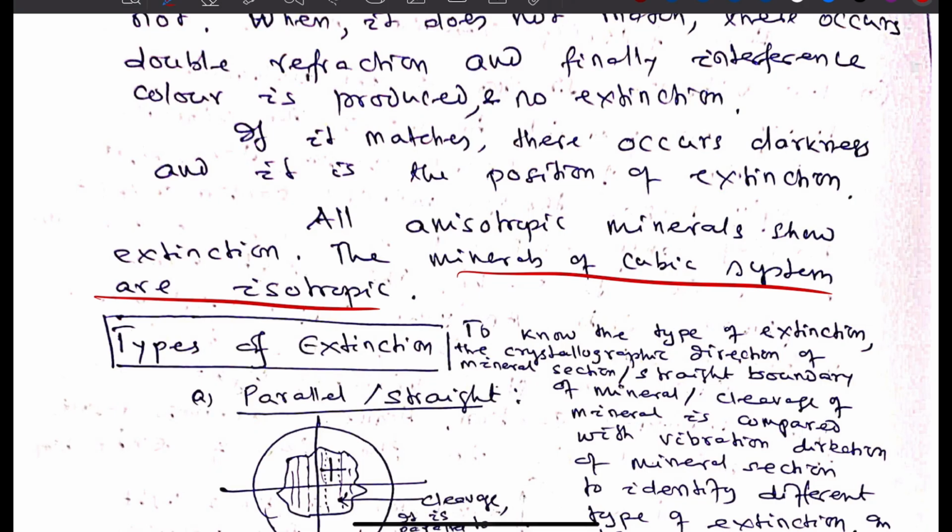If it is coming parallel to north-south of the microscope from the polarizer, it will simply pass through in that direction through the mineral section, and it will hit the analyzer perpendicularly, so it will not be allowed. Even if the stage is rotated, the same situation will prevail, and therefore the mineral section will show complete darkness, and it is a state of isotropism. So isotropism is seen by the minerals which crystallize in cubic systems or the mineral sections which are cut perpendicular to the optic axis.